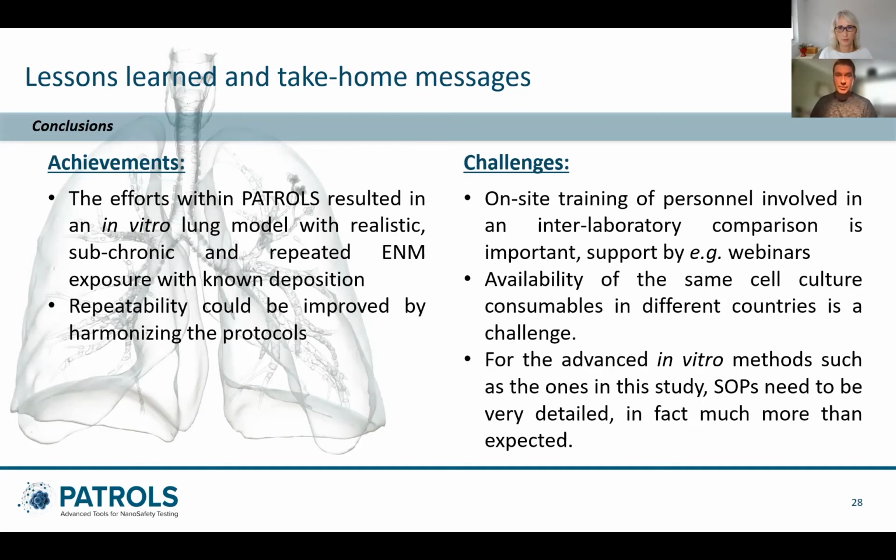Of course, this hasn't been possible for the past couple of years or 18 months because of the pandemic, but the online webinars and discussions have been advantageous, but nothing beats face-to-face lab exchange of information and knowledge. The availability of the same cell cultures at the same passage or the same batch, and the same with the chemicals or the assay-specific aspects, have been a challenge and will continue to be a challenge moving forward, but that's something that we can try and find a solution for.